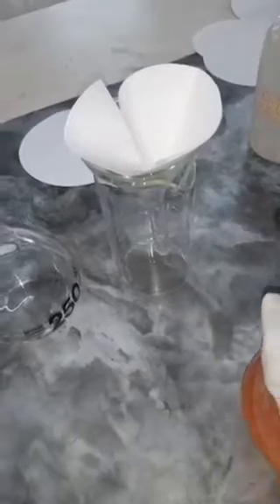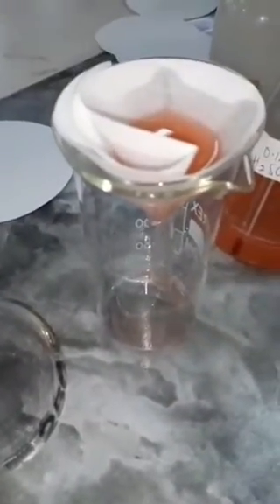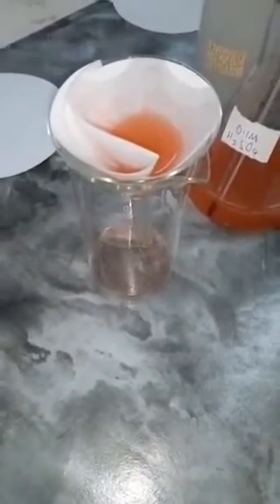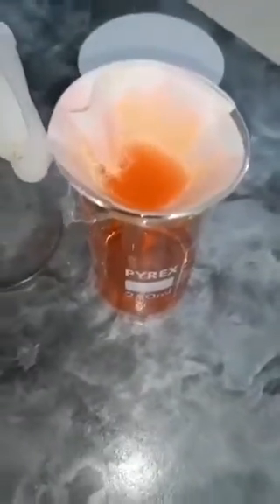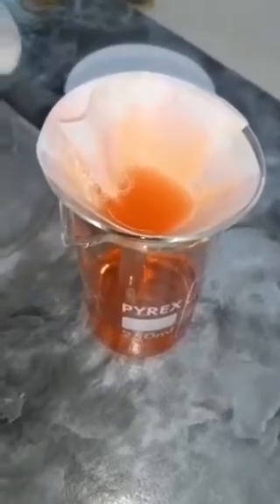Okay. So now I'm going to start filtering it into a beaker. I've folded my filter paper and I'm going to pour the solution onto the filter paper so that I filter it. This may take a while, so as you wait for this, you can prepare the potassium permanganate for titration. So I'm going to prepare the potassium permanganate for titration. The main reason why we are filtering is to get rid of the undissolved binding material from the tablets.